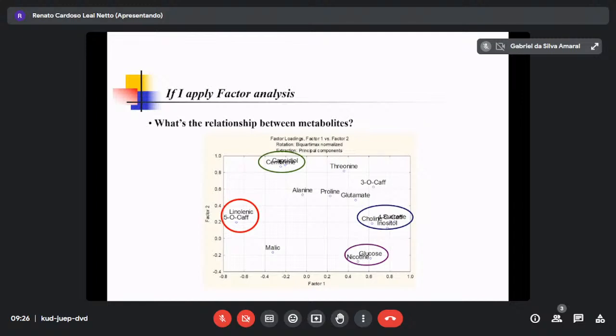You treated anti-inflammation data. Based on the loading plot, you found two or three compounds as having an effect. Then it's a starting point to look into another possibility, synergism. Two compounds related to this, increasing activity.